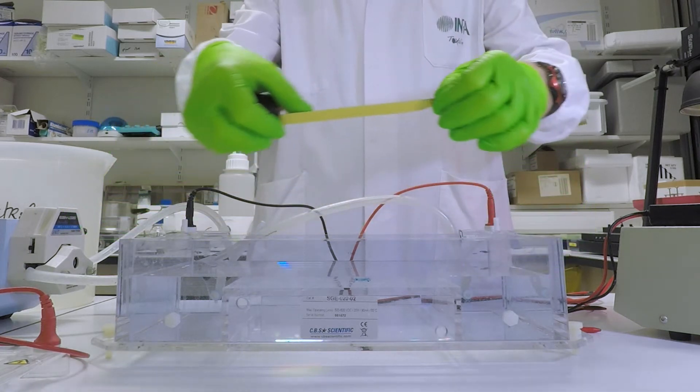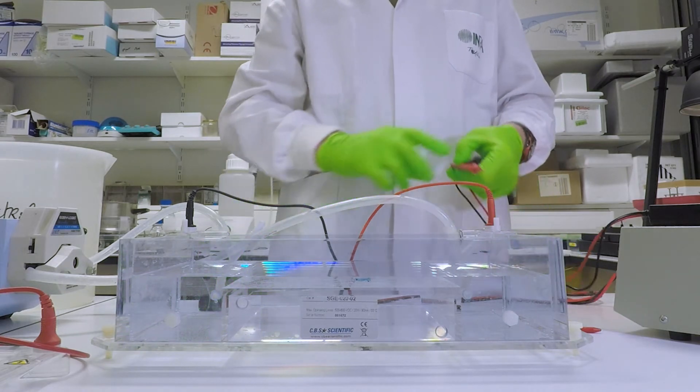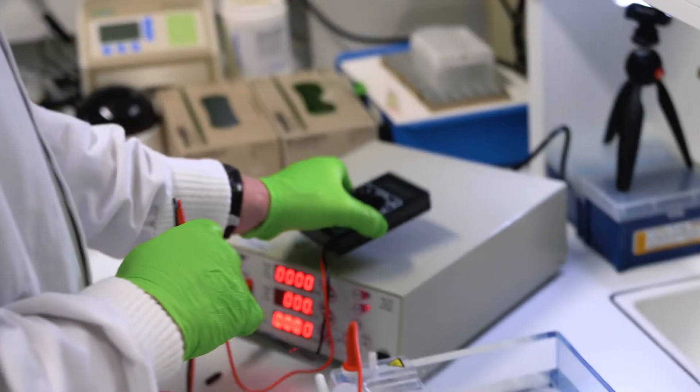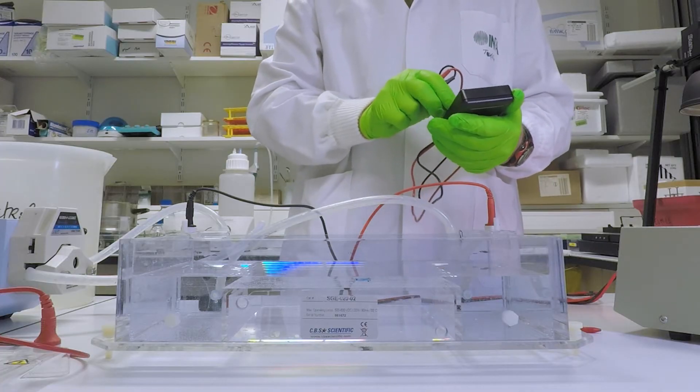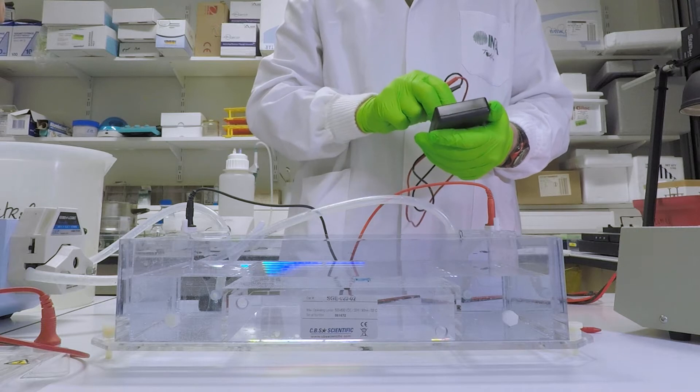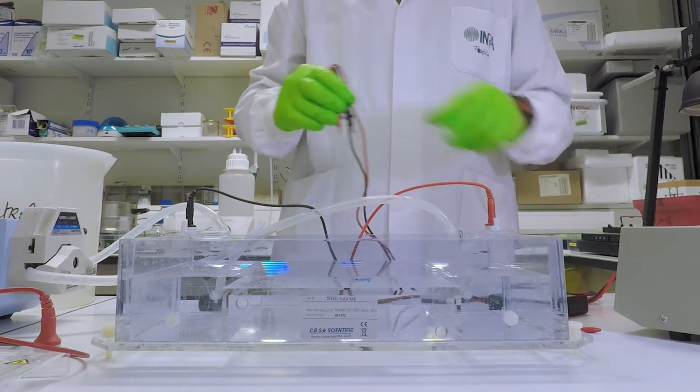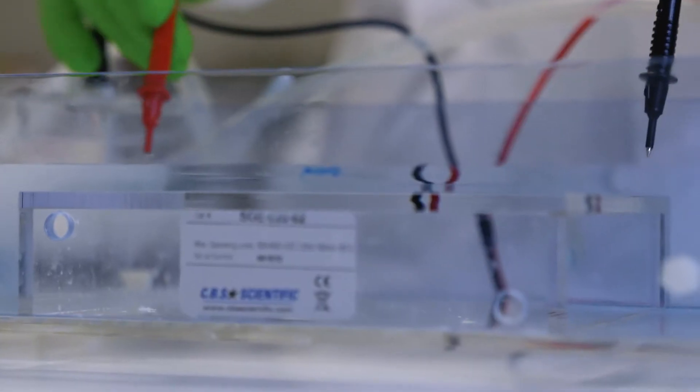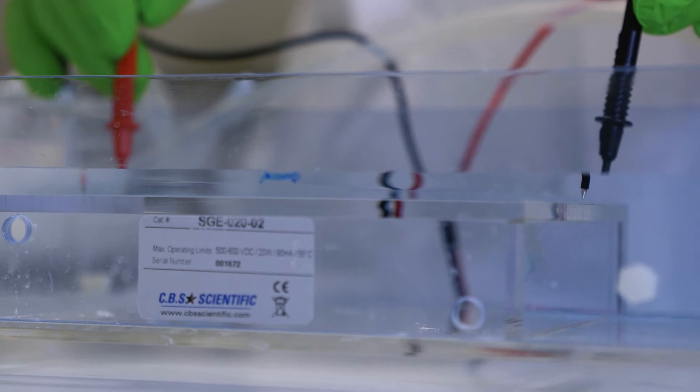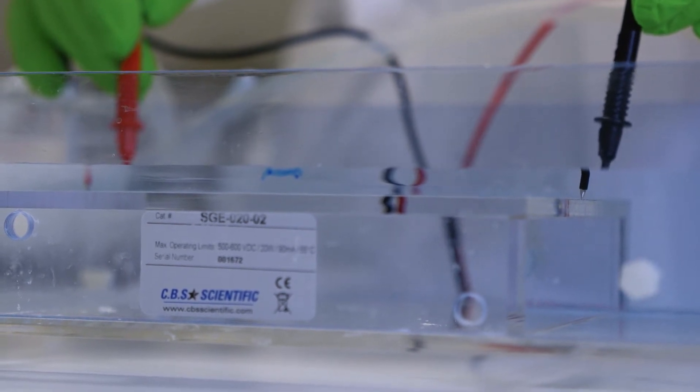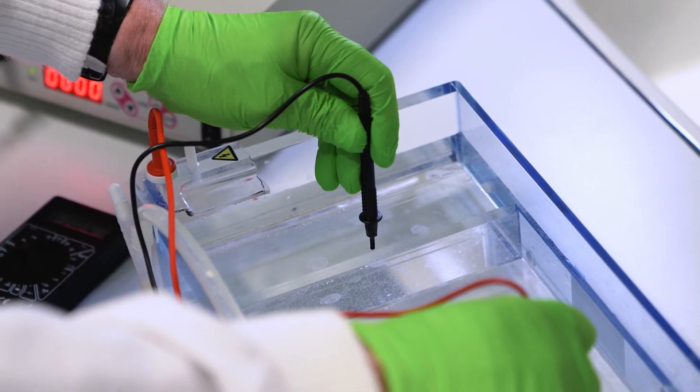But we subtract a tiny bit because you cannot measure at the very end of the platform. Then I use a digital voltmeter. I switched it on like that. And then I put the two probes into position on both sides. A few millimeters, as I said, from the edge of the platform. And I lift it up a tiny bit. And then I measure. It fluctuates a bit. But 10.7 volts.